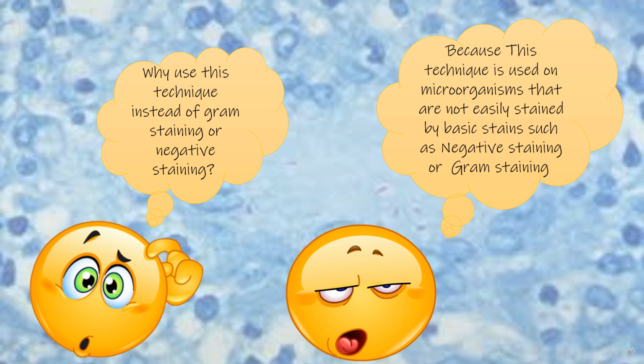Wondering why use this technique instead of gram staining or negative staining? Well, because this technique is used on microorganisms that are not easily stained by basic stains such as negative staining or gram staining.